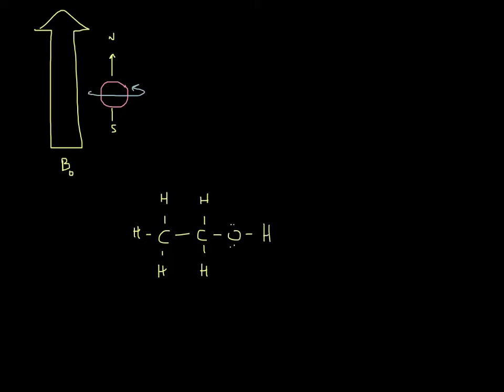Here we go. Oxygen has a mass of 16, so that would also not have a spin. So the only things that would have spins associated with them, and therefore little magnetic fields, would be these hydrogens. So all of these little hydrogens are all going to have little magnetic fields, and we're going to see all of those magnetic fields when we put them into an NMR magnet.